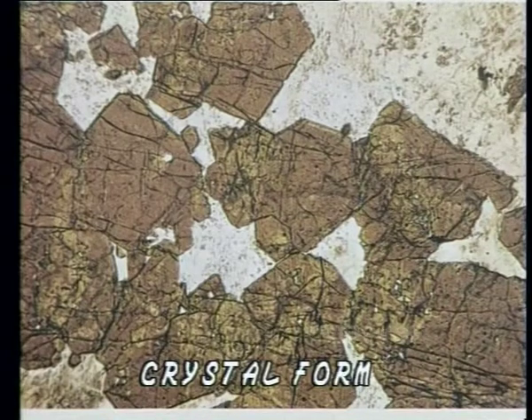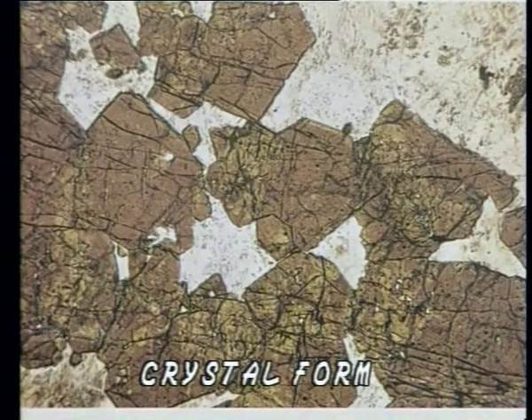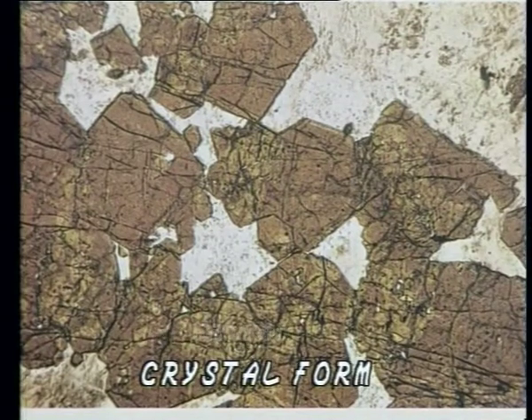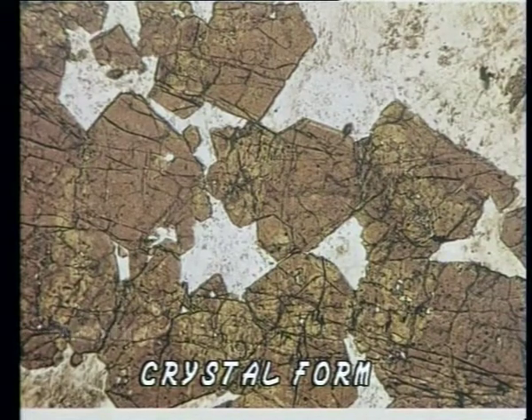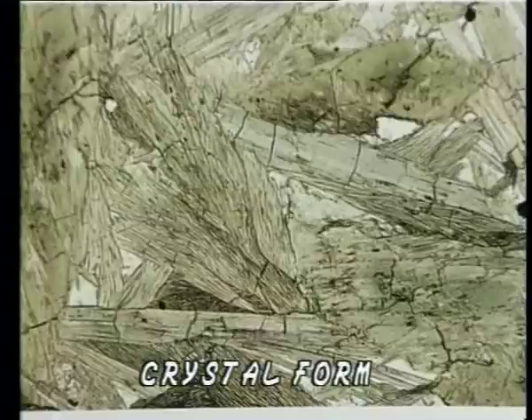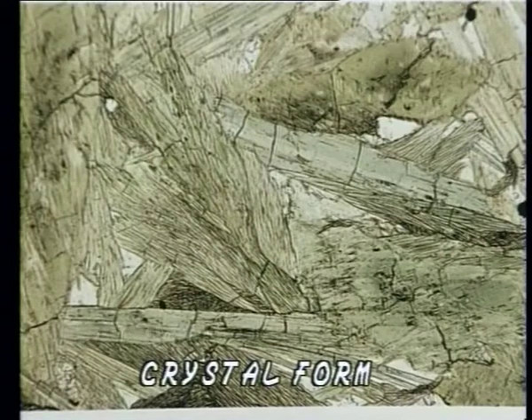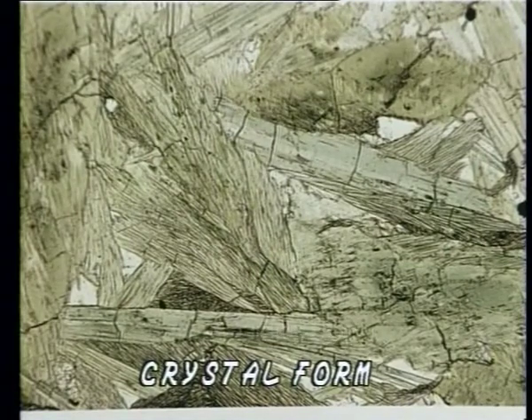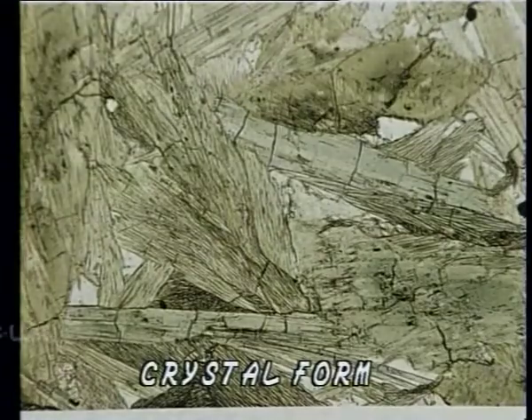Further, on the basis of shape, mineral grains can be distinguished as equant and elongated forms. Garnet is invariably equant. Acicular or needle-like minerals, for example, sillimanite, actinolite, etc., are recognized by the distinct elongation along one axis.